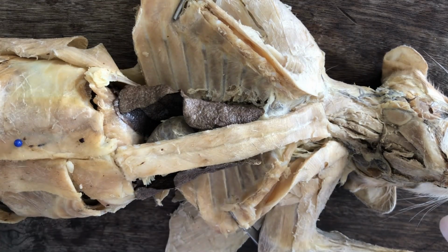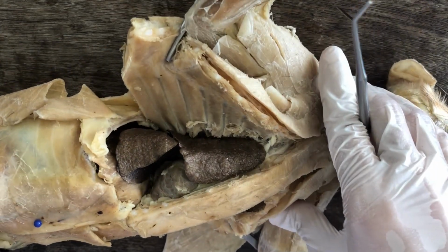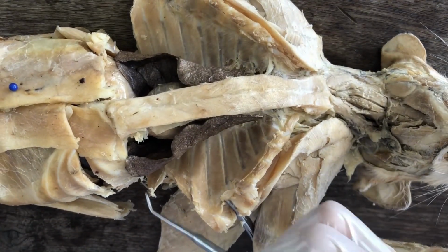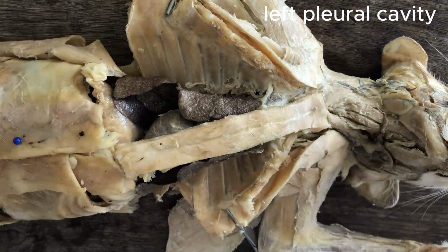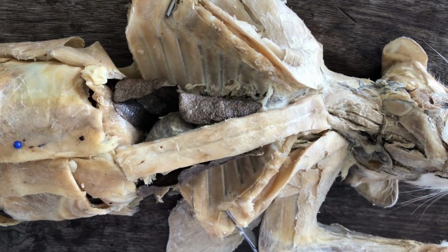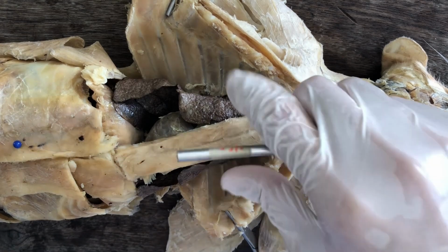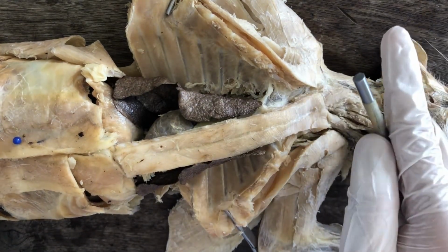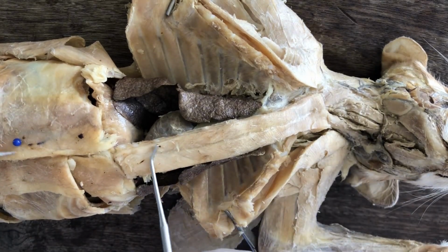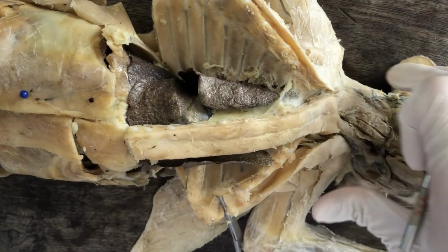Right, so the chest cavity, the pleural cavities, are divided into a left, sorry, this is the right, and then this is the left pleural cavity. Okay, I'll have a separate discussion or video on the coelomic cavities and the serous membranes covering those cavities of the cat. But in this video, I'm going to focus on the organs, not the connective tissues and mesenteries and pleura, so that it will be a focused video.